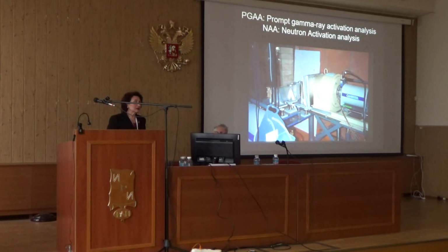And so the results I had were terrible. I was not happy about them at all. And also the pieces were radioactive afterwards, which is not something you like really. And the same problem was with neutron activation. So I tried to avoid that if I can, of course.